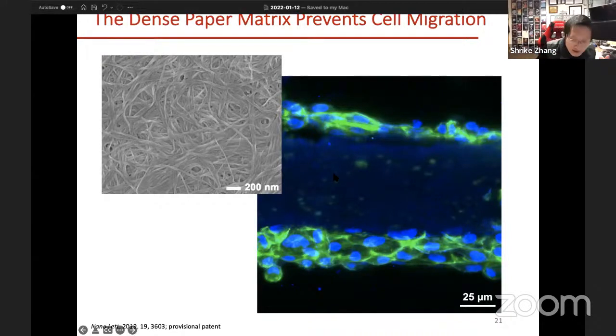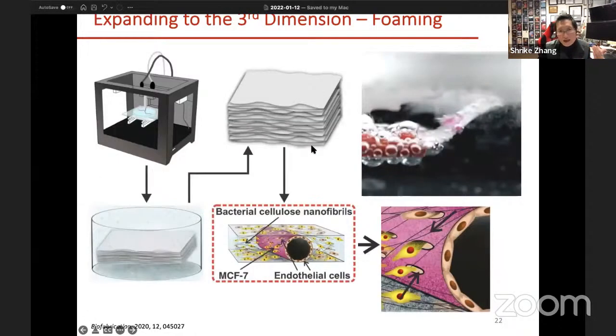So within that, can you actually solve this issue by treating the device with something else? Can you actually bubble the device to allow their expansion and create these microscale pores within the layers to allow their functionality, right?